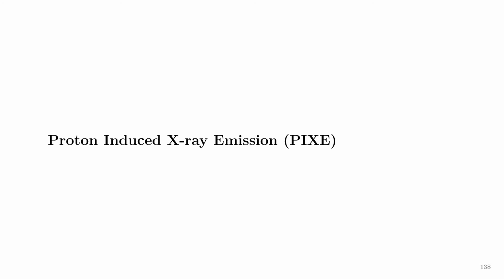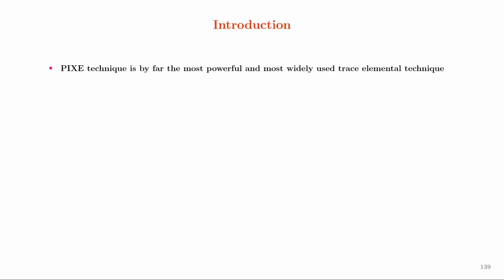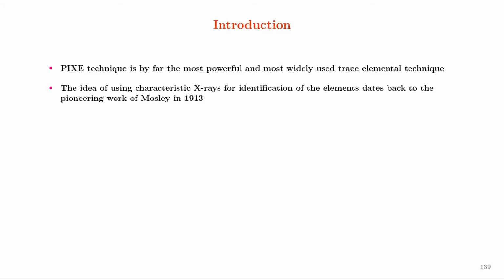We shall move our discussion to proton induced X-ray emission, or PIXE, a technique used to determine the elemental makeup of a material or sample. PIXE is by far the most powerful and most widely used trace elemental technique. The idea of using characteristic X-rays for identification of the elements dates back to the pioneering work of Moseley in 1913.